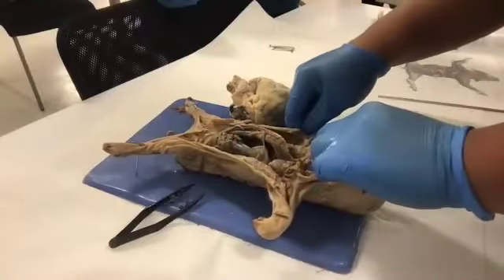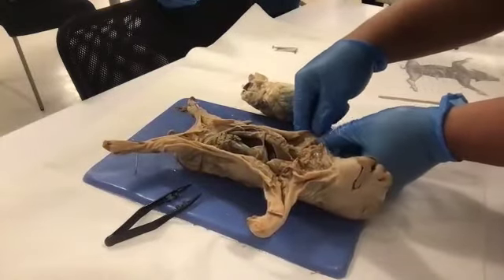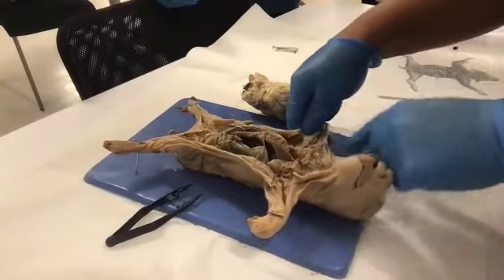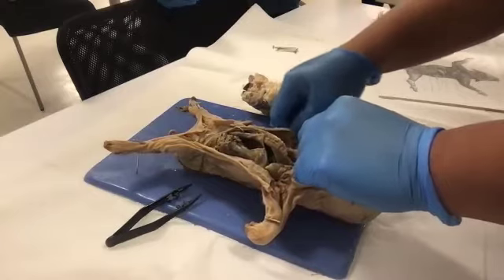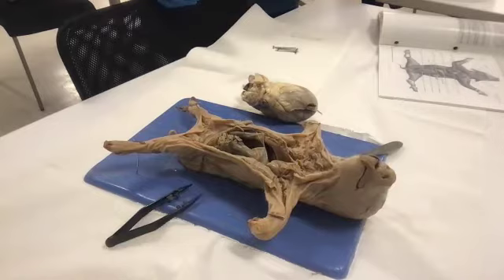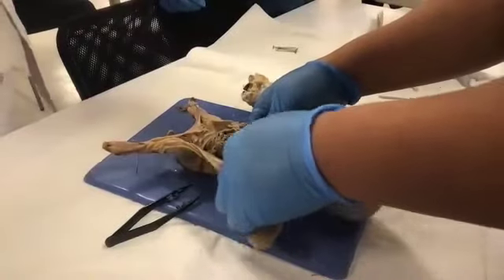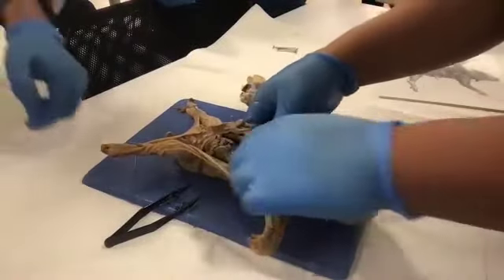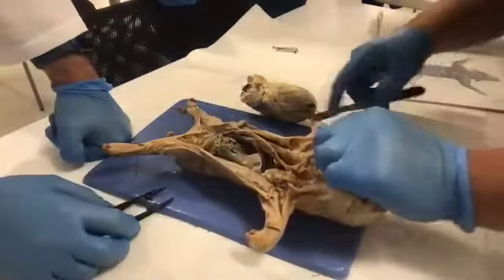Now, the next thing that the group was doing was we were looking at the tendons and the other ligaments here. You could tell how they are because they're not only shiny, they're also just like the skin, hard to break. So did you guys identify fascia or this covering that connects bone to muscle? You could look at it. Oh, yeah. Here's your ribs. Okay, let me dissect this a little bit better.